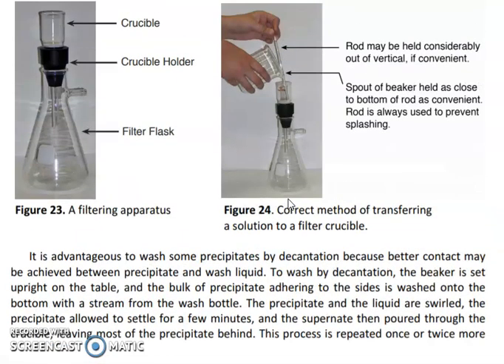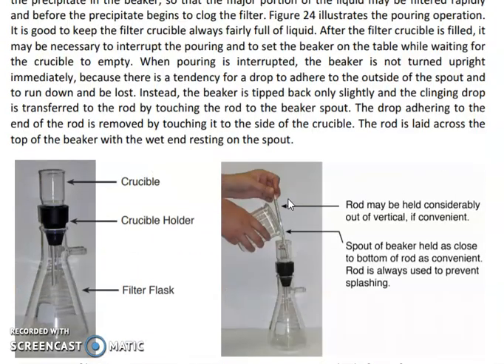So I hope this video will be helpful to you. In this video I showed you how to do the filtration of your precipitates.